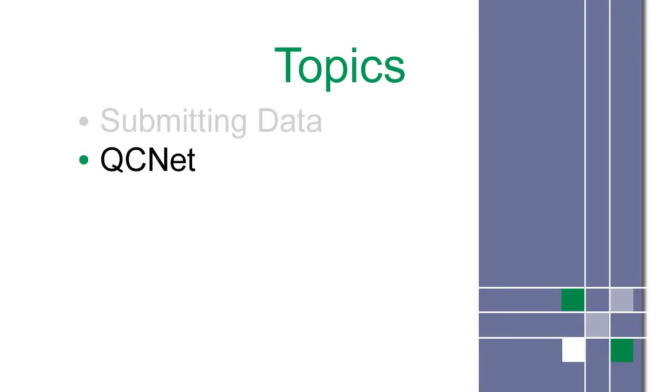In the last step, you submitted your data to the Unity Interlaboratory program. After this data has been processed, you can access your peer reports on QCNet.